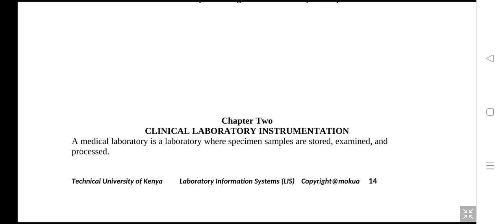I don't know how you define laboratory, can you write how you define laboratory? I'm starting from storing, examination, and processing. Of course, we examine this specimen, and we process this specimen. When we process, that is when we get some data using various techniques. So we get some results.